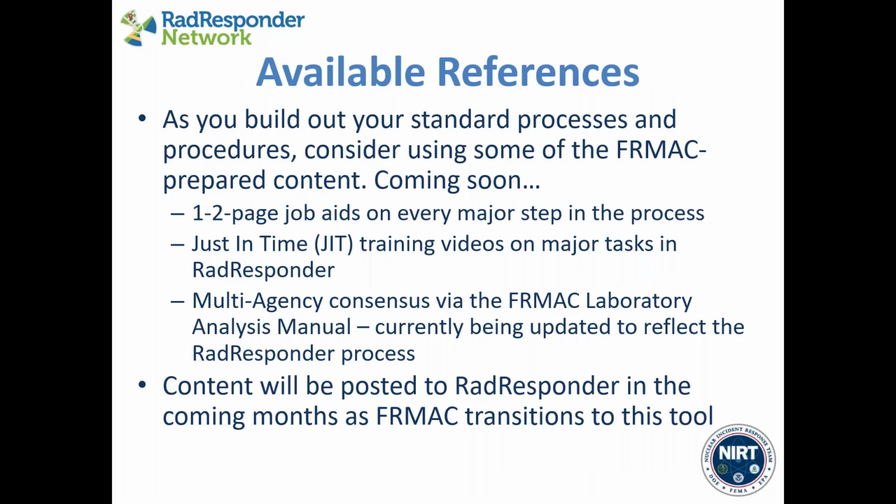As part of the project, we've developed training content and job aids for using these new features. A whole bunch of one to two page job aids on every major step in the sample control and laboratory analysis process. We've recorded a couple of training videos on the major tasks in RadResponder that can be used to train a new person very quickly on a specific task.